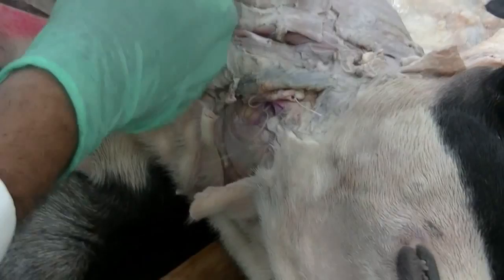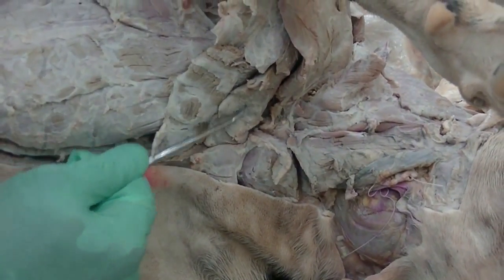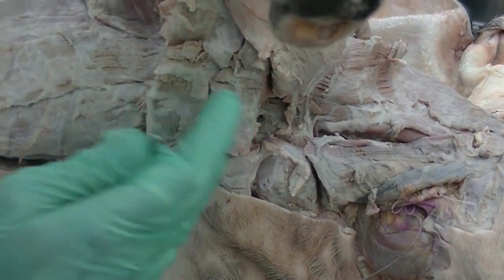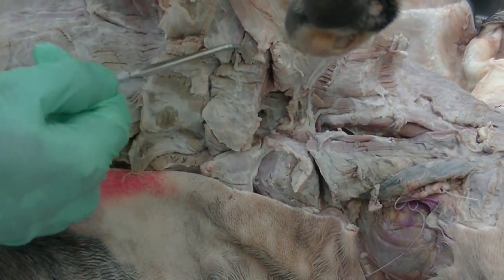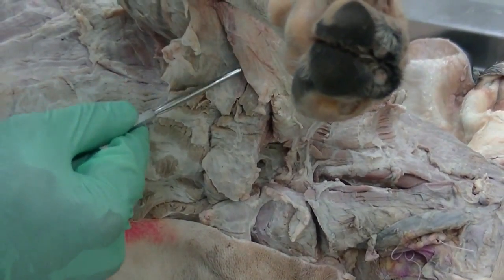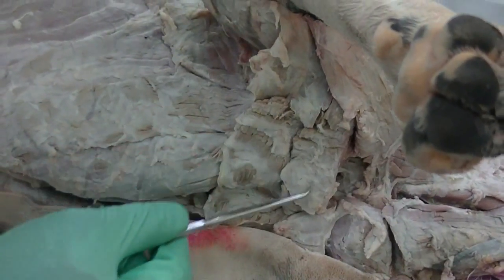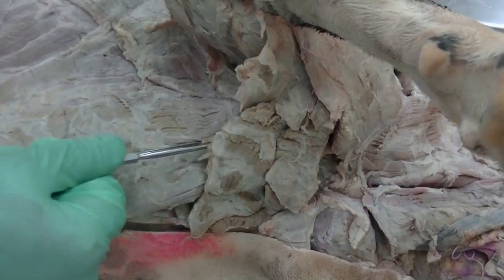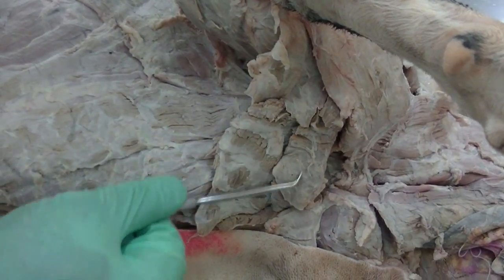As we put them back in their order, we can see from the ventral midline the muscle which goes from the sternum. If the limb is held in the actual position the way it would be in the live animal, the muscle seems to be running backward to get attached to the humerus in the arm of the forelimb. That is your descending pectoral muscle. Slightly underneath the descending pectoral, we have a flat muscle which also arises from the sternum, almost in the same region as the descending pectoral.